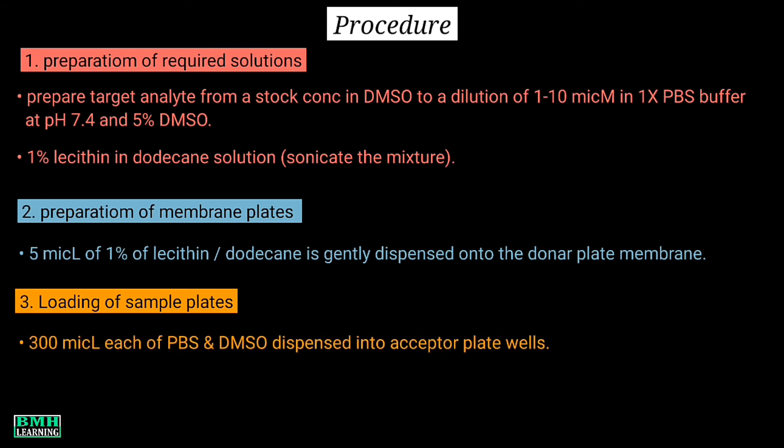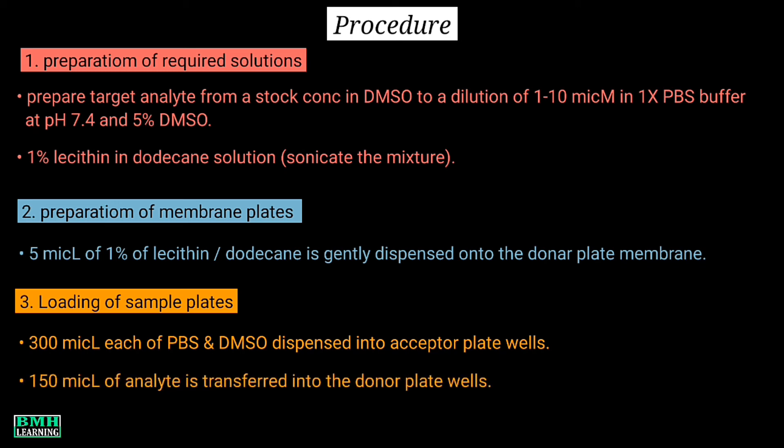For loading of sample plates, using a multi-channel pipette, 300 microliters each of PBS and DMSO are dispensed into the acceptor plate wells. Similarly, 150 microliters of the analyte is transferred into the donor plate wells.